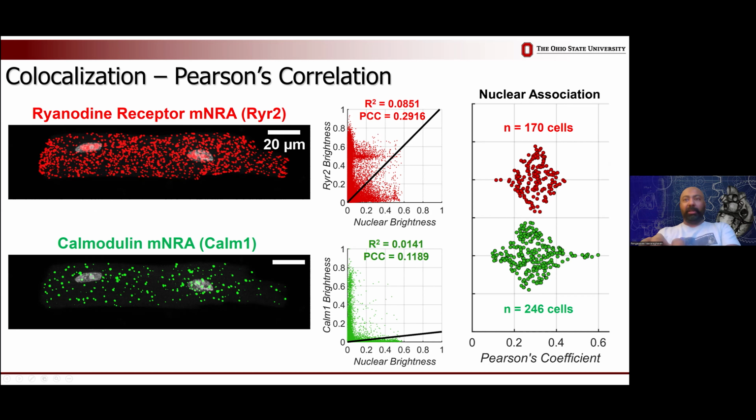They looked at a whole bunch of cells, a few hundred in fact, using the traditional form of cross-correlation between colors. So in this case, they're cross-correlating red with gray or green with gray, and they're ending up with the result that, yeah, no, both of these really have the same sort of distribution relative to the nuclei. But there's one small little detail to be careful of. If you're looking for superposition, you're really looking at a tiny, tiny subset of the red and green signals. You're ignoring most of it, which is really the interesting bit.